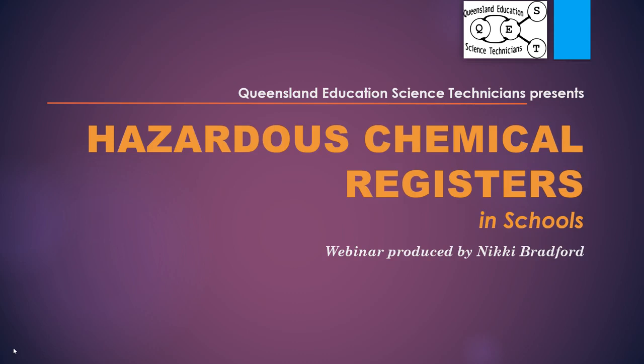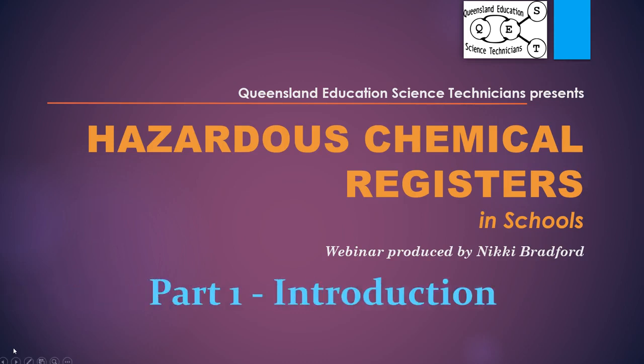Today I'm going to be talking to you about hazardous chemical registers in schools. As part of working in a school laboratory, staff are required to maintain documentation and records in order to manage workplace practices and help keep everyone safe. Registers assist in documenting compliance with legislative safety requirements. This webinar will guide you through setting up and maintaining a hazardous chemical register.